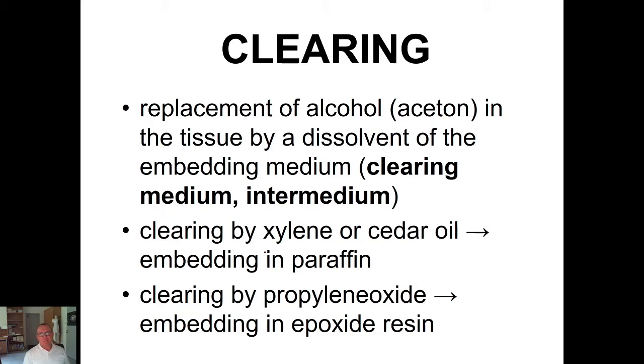The next step has to be to extract this dehydration medium from the tissue by a dissolvent of the embedding medium, and this is called clearing, because the tissue becomes usually translucent during this procedure.